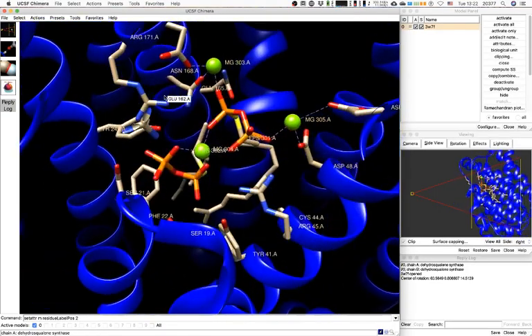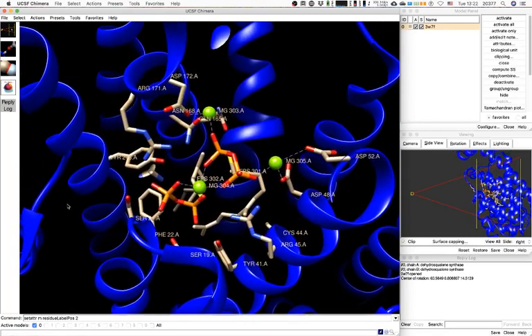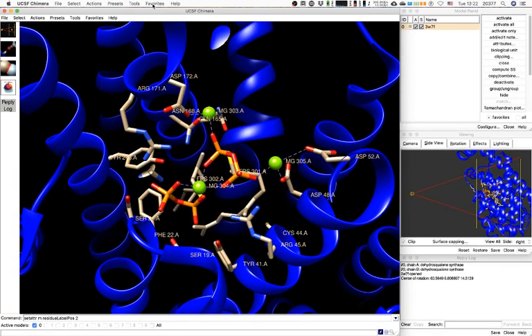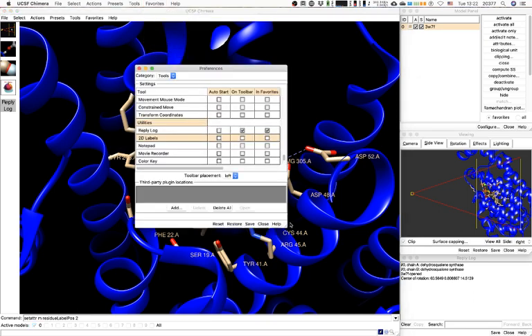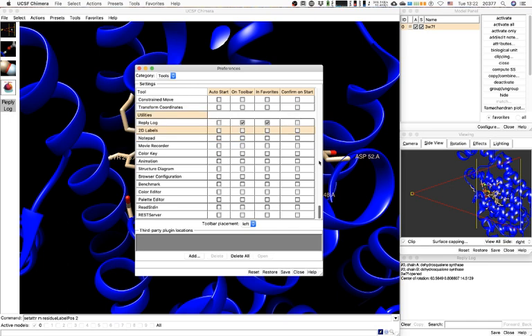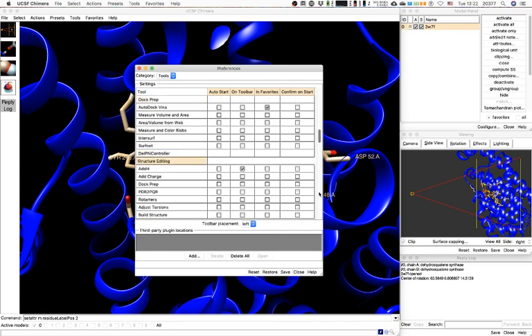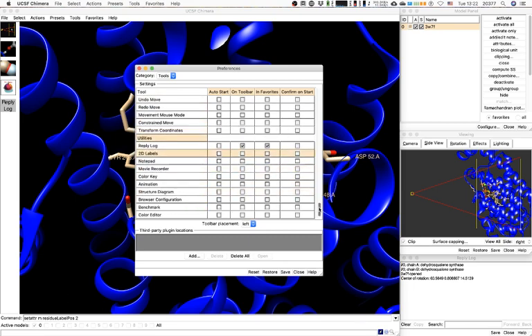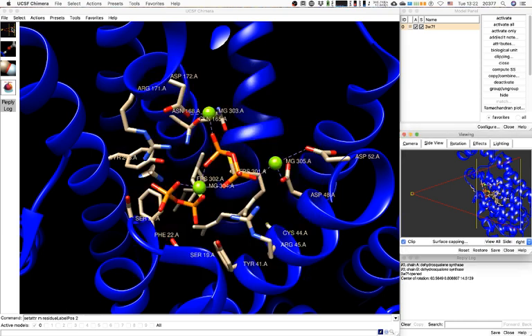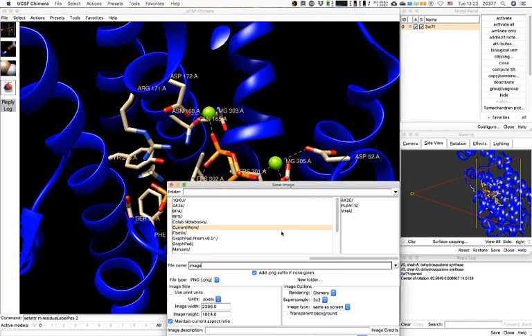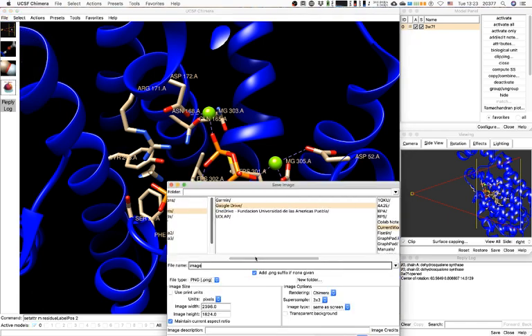It looks nice. Have I shown you how to save an image? I'll go to File > Save Image and send it to the desktop. There we go — a nice image. Let's continue with the tutorial.